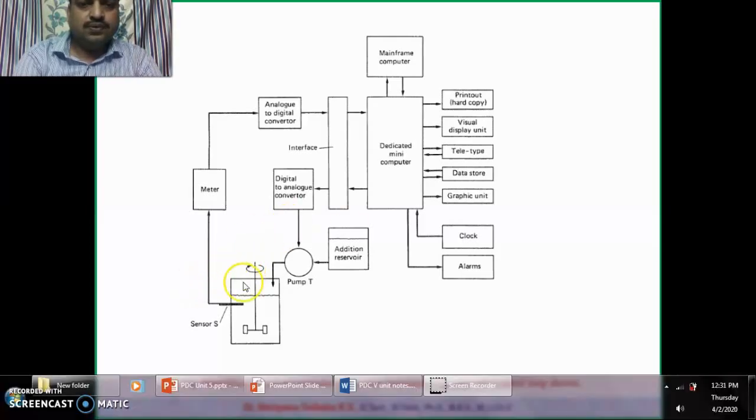For example, here we have used a fermenter, and we want to control pH by using alkali or acid. Just assume that. For controlling this process, we use an ordinary feedback controller, so the mechanism will be similar. We use the traditional feedback control mechanism here.